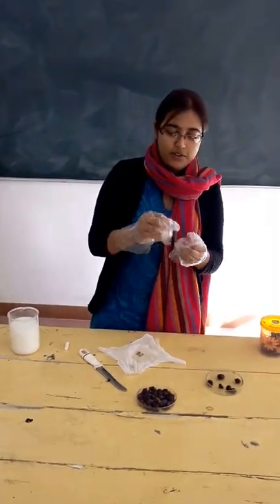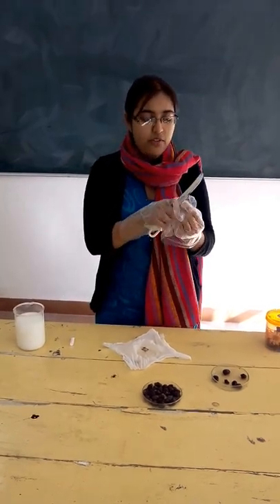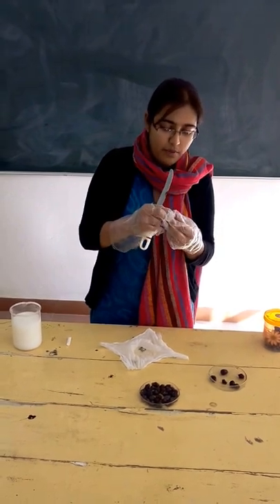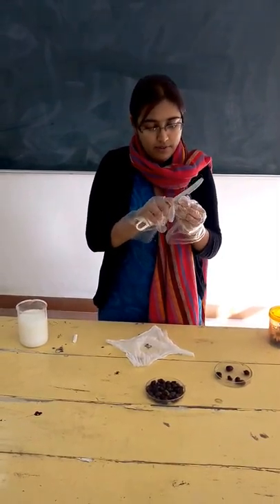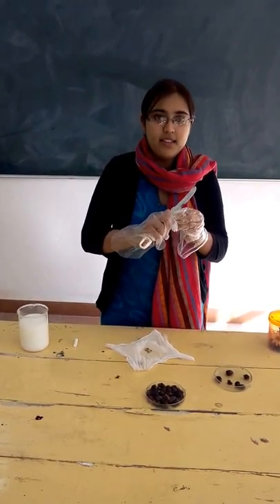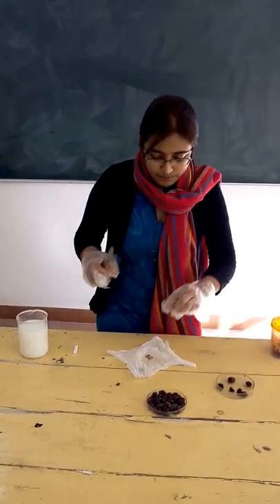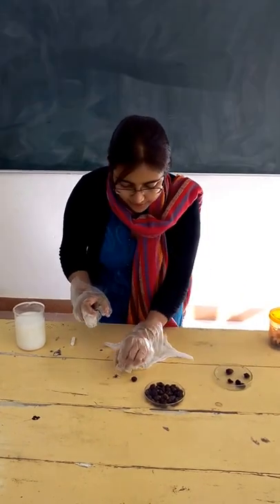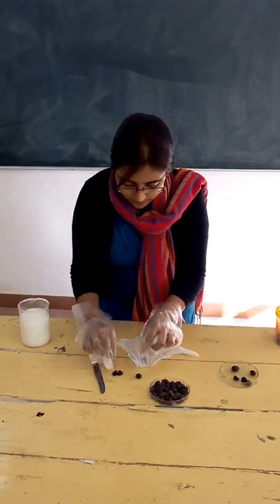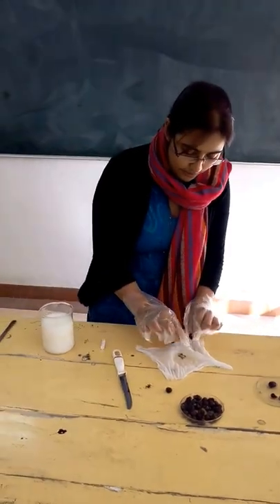Now we will take the seeds of Semicarpus anacardium and we will scratch the epidermal layer by the help of a knife. As the epidermal layer is removed, we will cut the nuts into two halves.